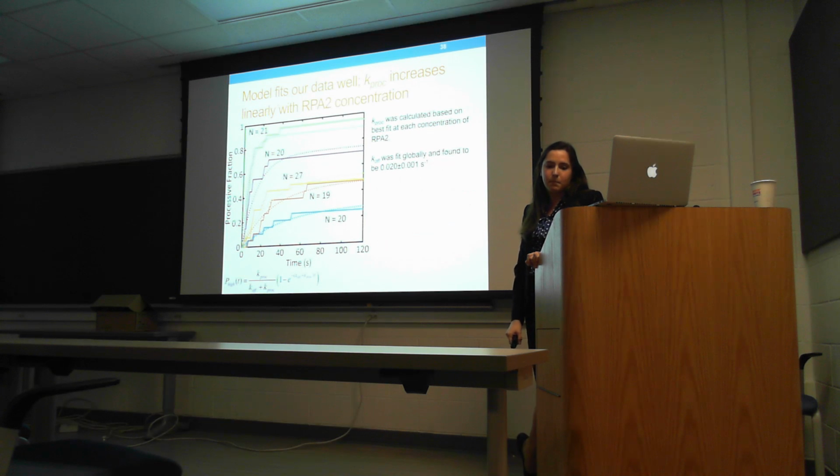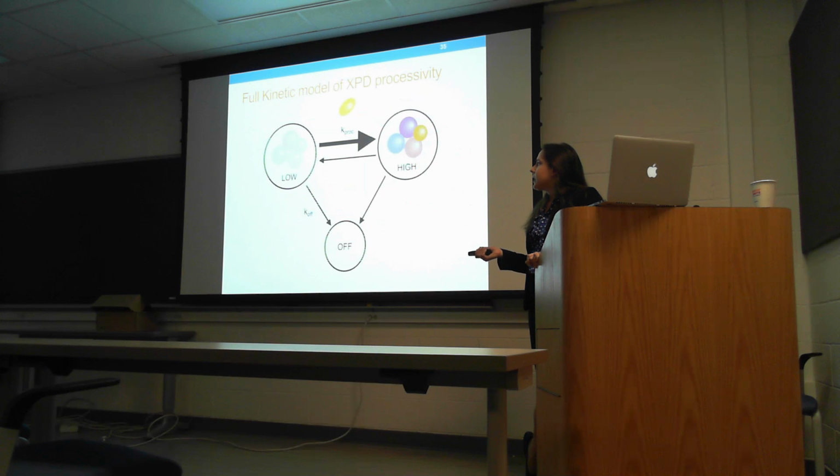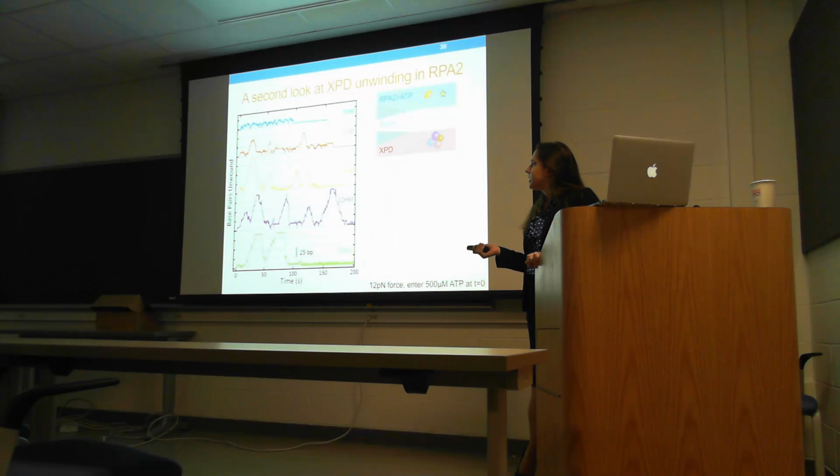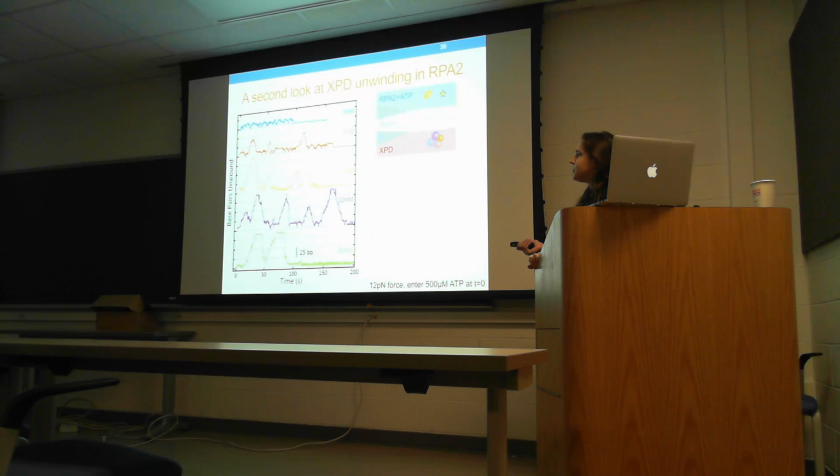Well, can you not? Presumably you have these processive events occurring in rapid succession. Yes. So if you look at, let's go back to some unwinding traces. Yes, you can have processive traces happen one after the other or with some break between them.